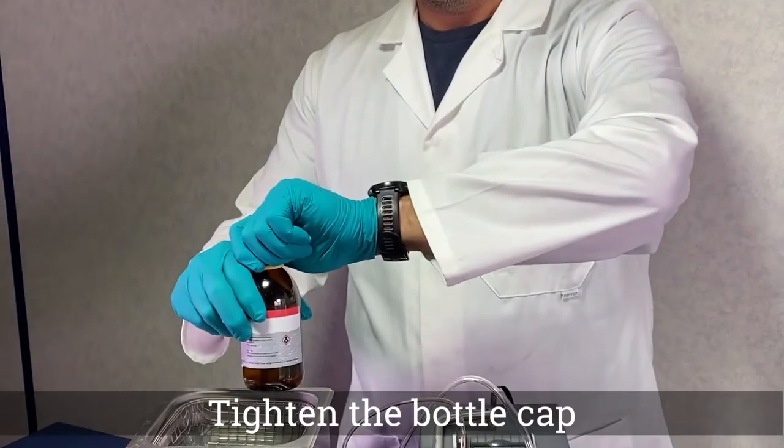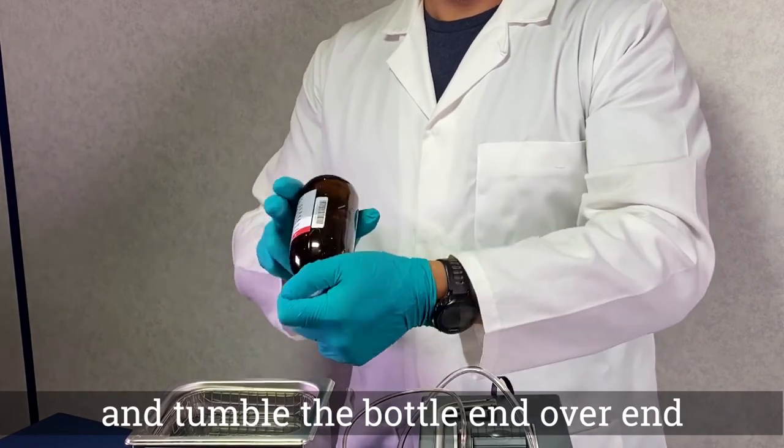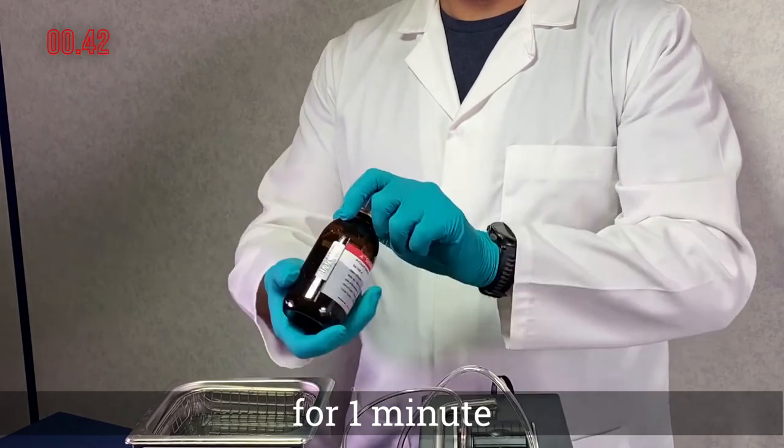Step 3. Tighten the bottle cap and tumble end over end at one revolution per second for one minute. Use the stopwatch.